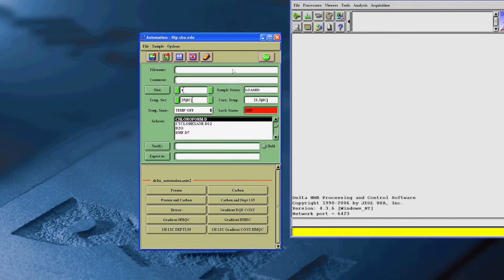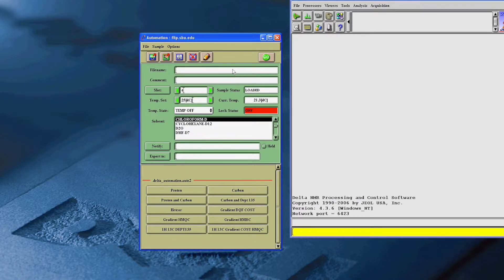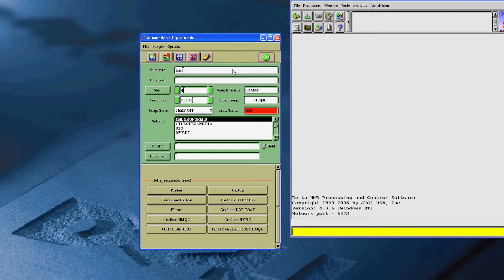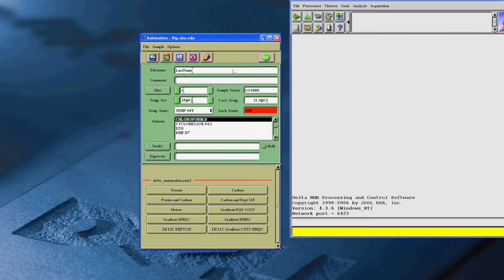First, enter the file name. This will be your last name, first name, and then the full name of your NMR sample.